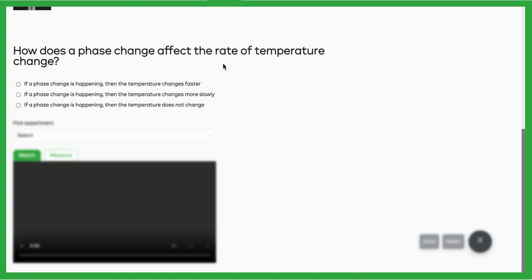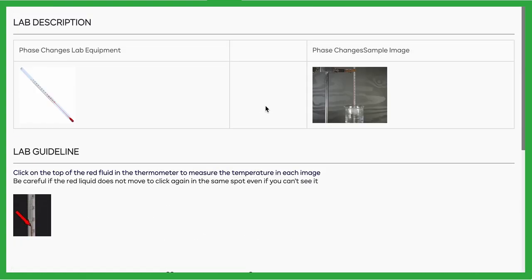It could be solid straight to gas, that's called sublimation. So melting, boiling, those kinds of things, those are phase changes. What you're going to do is look at a substance with a thermometer, and you can see the setup here, the thermometer in, say, a liquid like water.